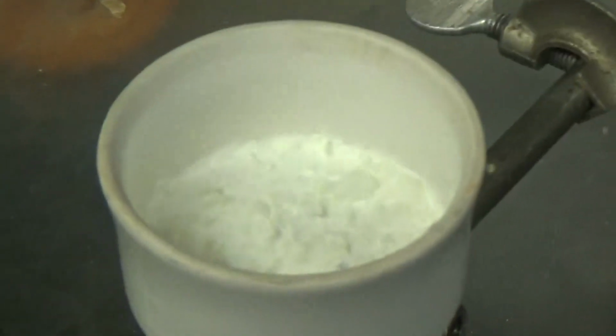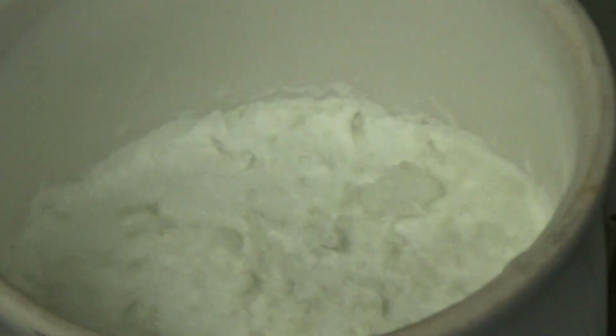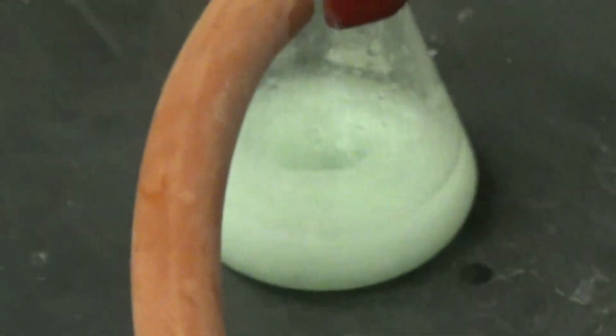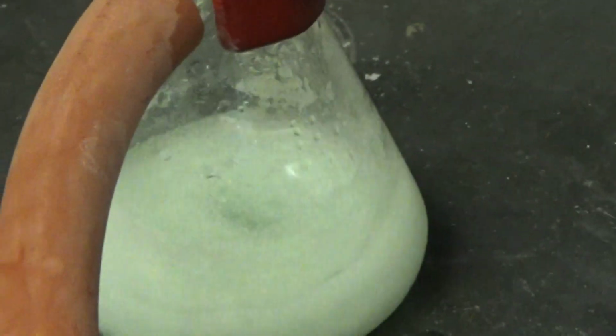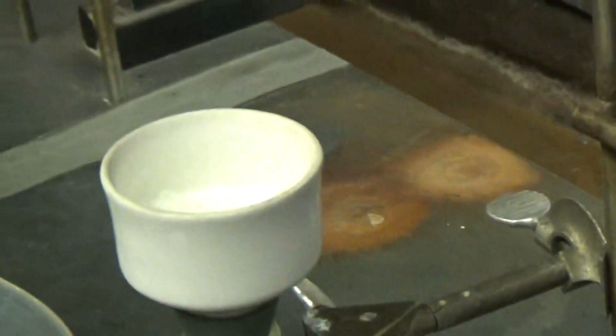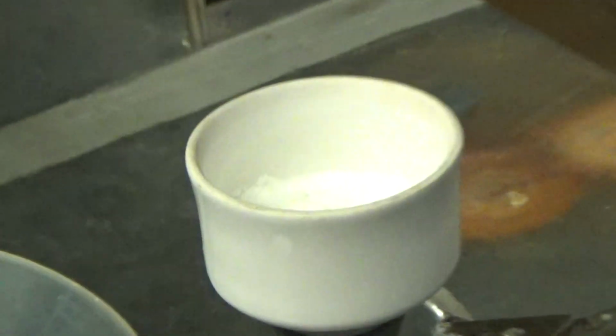And so the product looks like that white solid. So that's the benzil, the diketone? That's the crude product, because we're also going to recrystallize. And maybe a little bit came through also, but we're probably going to throw that away. What you see at the bottom, that's garbage. But we have some apparent crude product, which is nice.